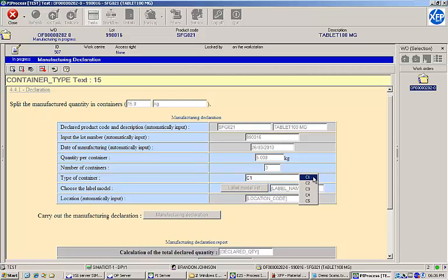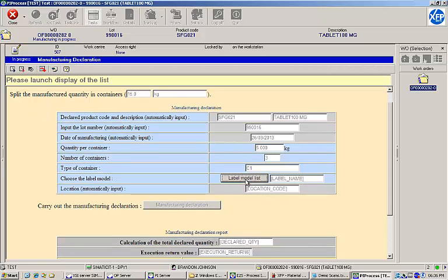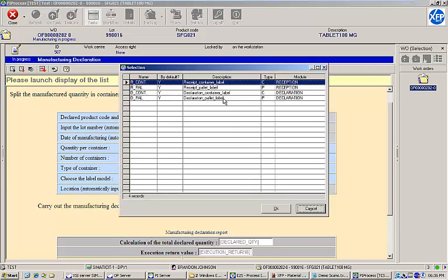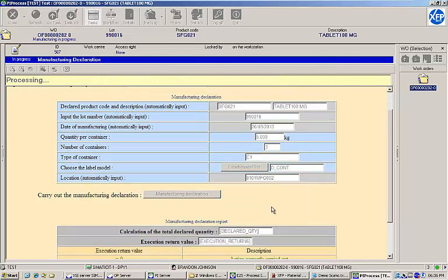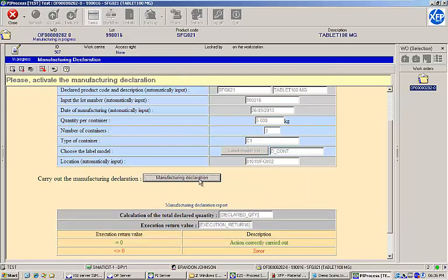Next, we'll choose the container type and label template that we want to print. We'll click the button to perform our manufacturing declaration and print our container labels.